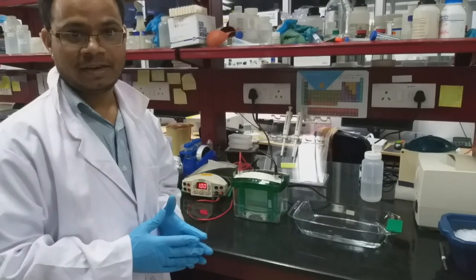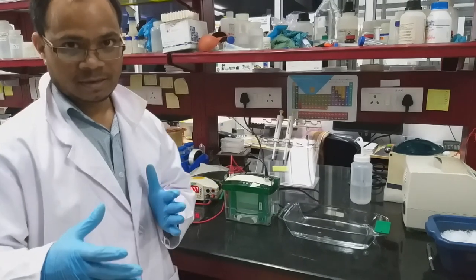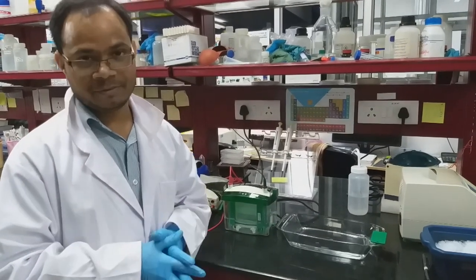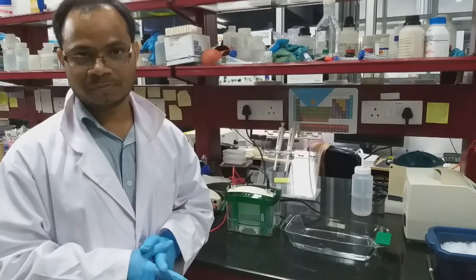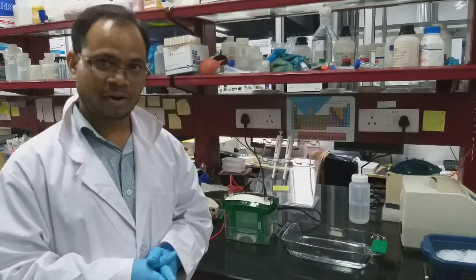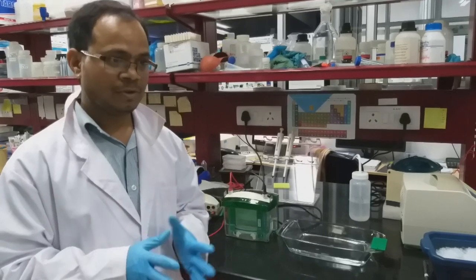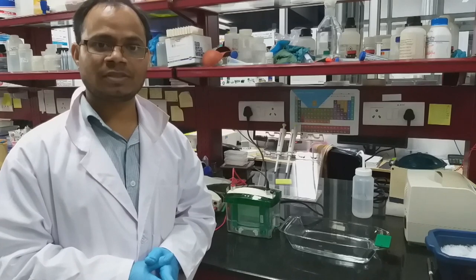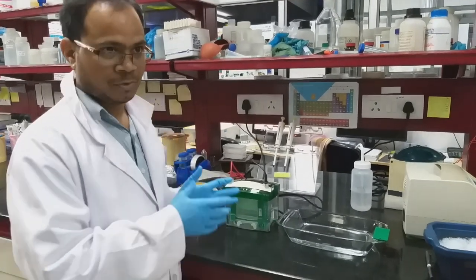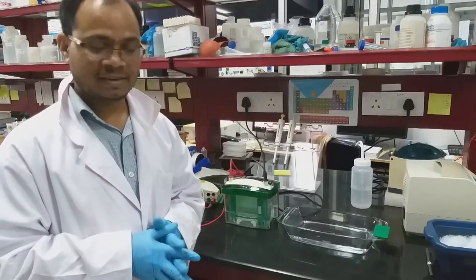So we can take out the gel, then we will stain and de-stain it. There are two ways of staining and de-staining. One is quick staining, where we heat the gel with the staining solution, which contains Coomassie Brilliant Blue along with methanol and water, then de-stain with water by heating. Another way, the simplest way, is to stain the gel for 2 hours, then de-stain overnight. I am going to show the simplest way. First we stain in Coomassie Brilliant Blue staining solution, then we de-stain in methanol water containing acetic acid.